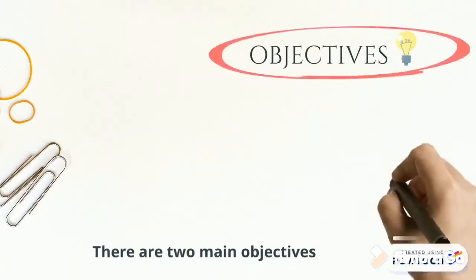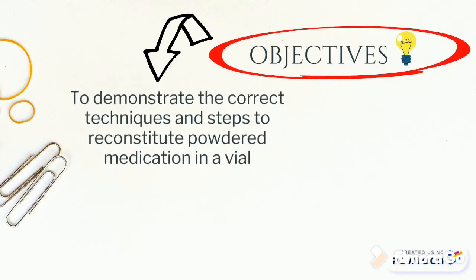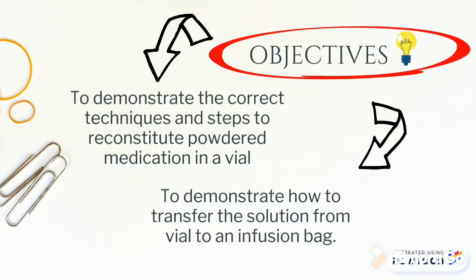There are two main objectives. First, to demonstrate the correct techniques and steps to reconstitute powdered medication in vial. Second, to demonstrate how to transfer the solution from vial to infusion bags.